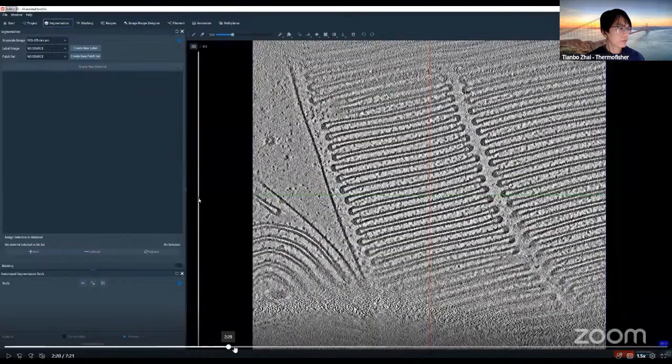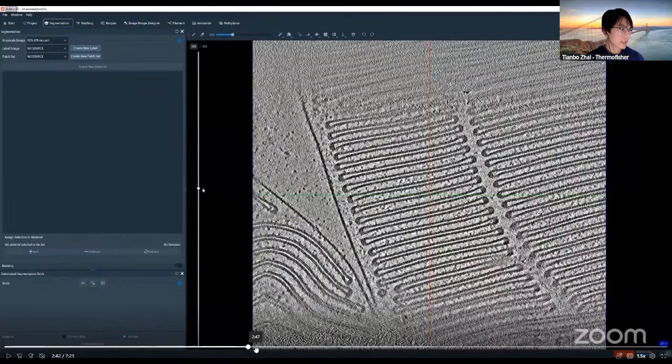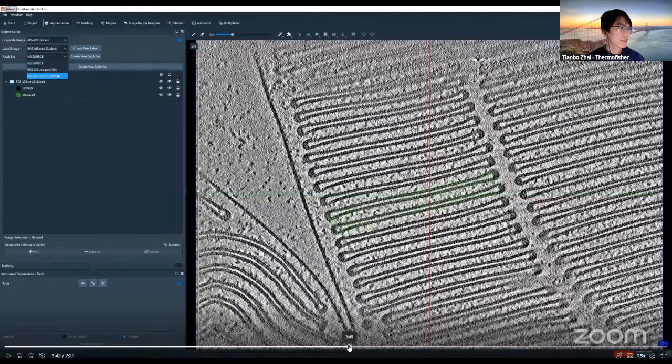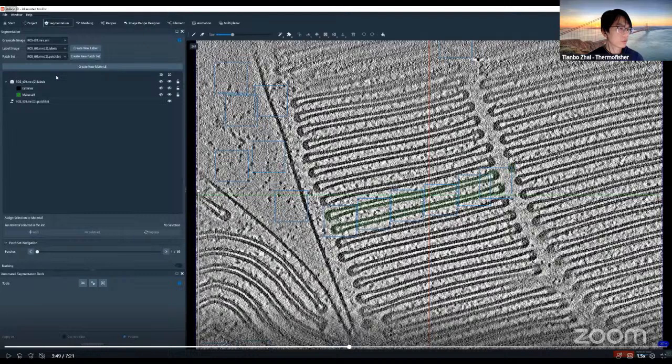And going from here, there will be, again, some visualization check. And the actual AI assist segmentation starts when we create such a patch set. It is called a patch set, so it's essentially a set of small squares. We will place those rather randomly, but also try to have a good representation across the 3D space.